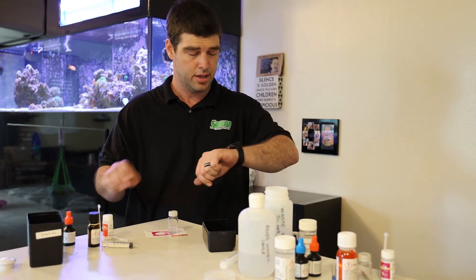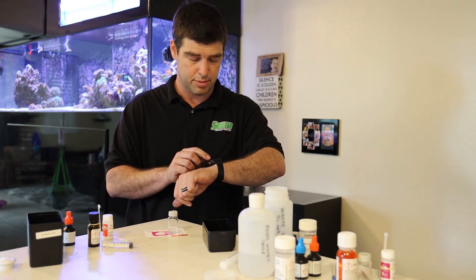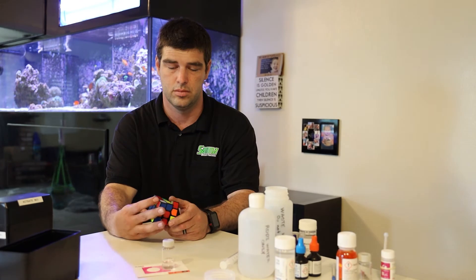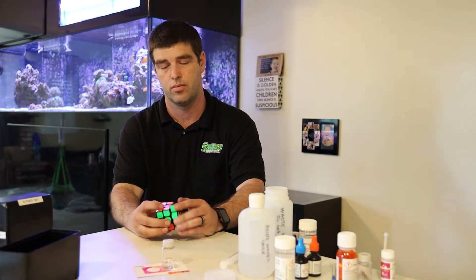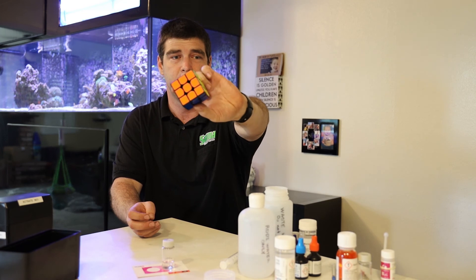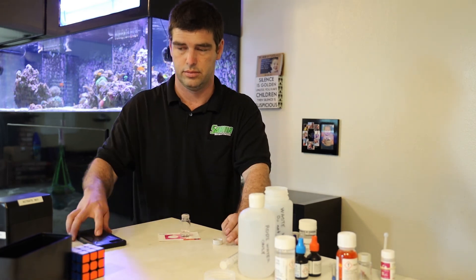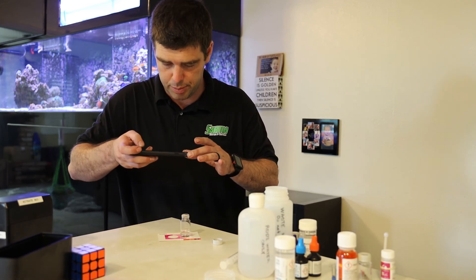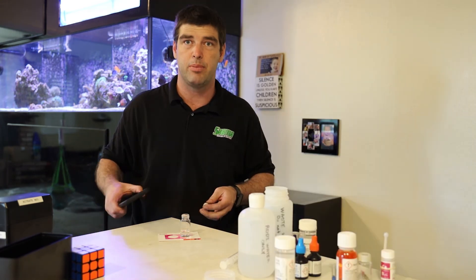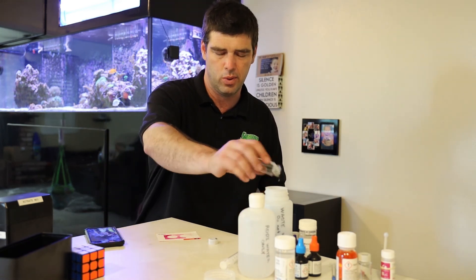So after reagent C, you're supposed to wait 10 minutes or nine minutes. I'm going to use my watch and set a timer right now. Not very fast, but it's done, and I still got three minutes to kill. Get a nice little picture here of what the color looks like. Always look down through it when you're trying to figure out how many parts per million you have. I've never had this test lighter than this, so I'm either at zero or one, and I can't tell.